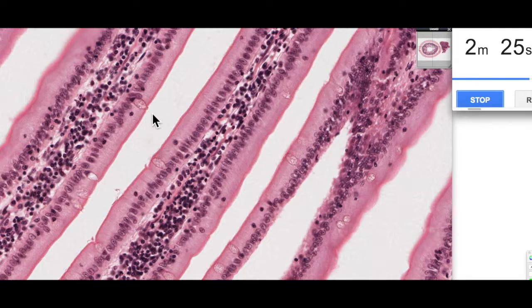We also talked about the poor staining of mucin which is one of the functions of the goblet cells to produce mucus. Loss of sugars prevents the eosin interacting with a protein backbone and therefore it's relatively unstained.